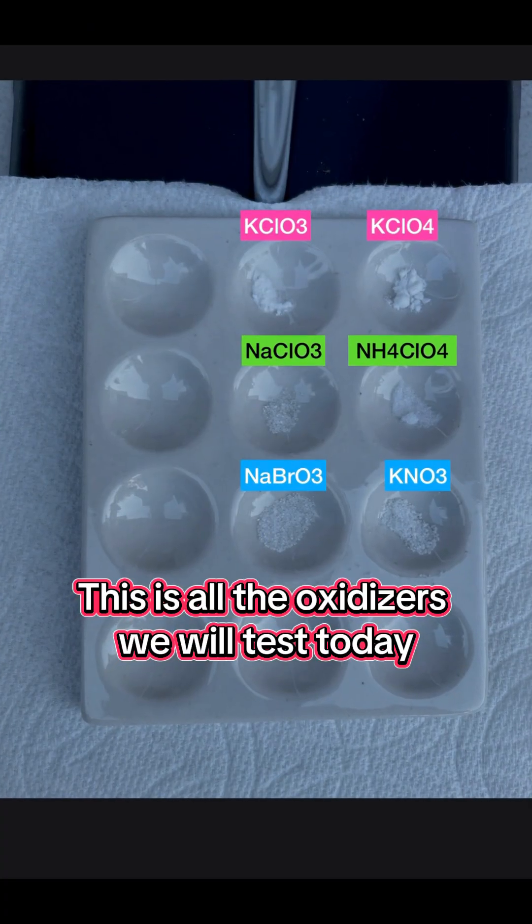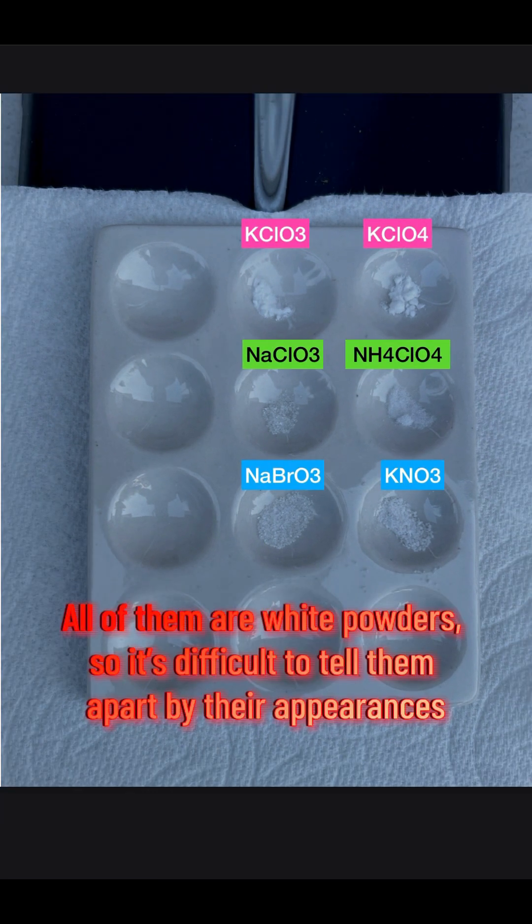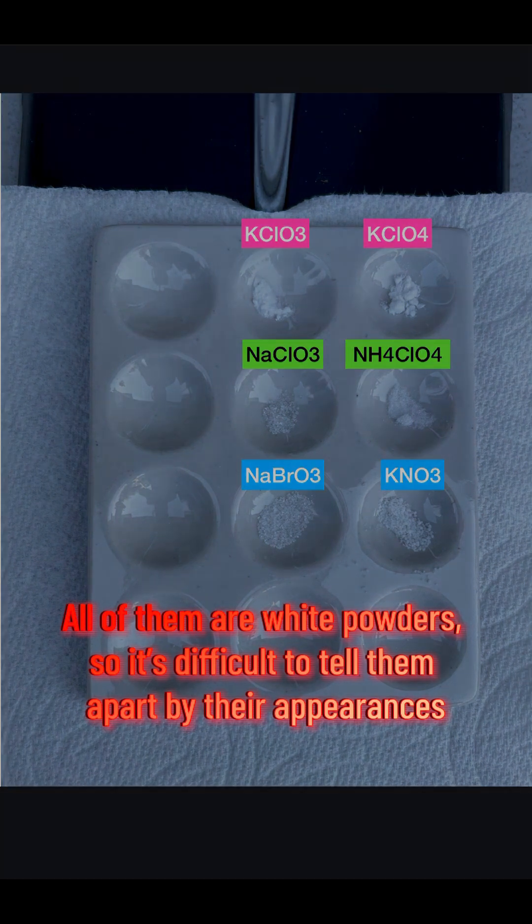These are all the oxidizers we will test today. All of them are white powders, so it's difficult to tell them apart by their appearances.